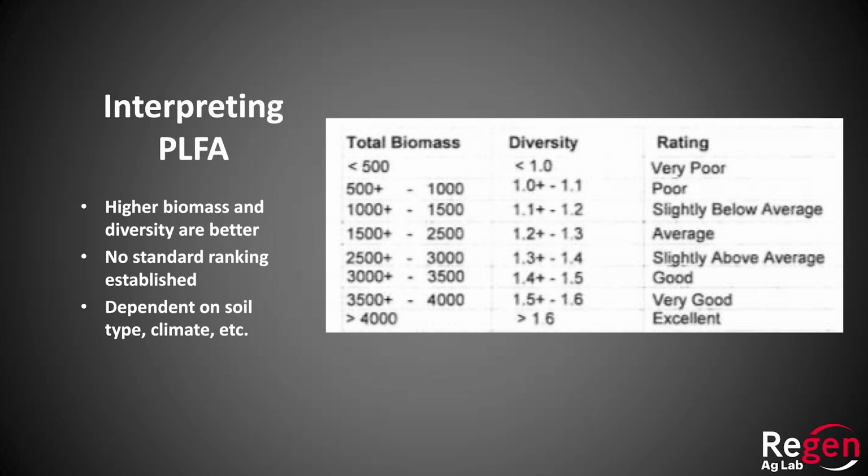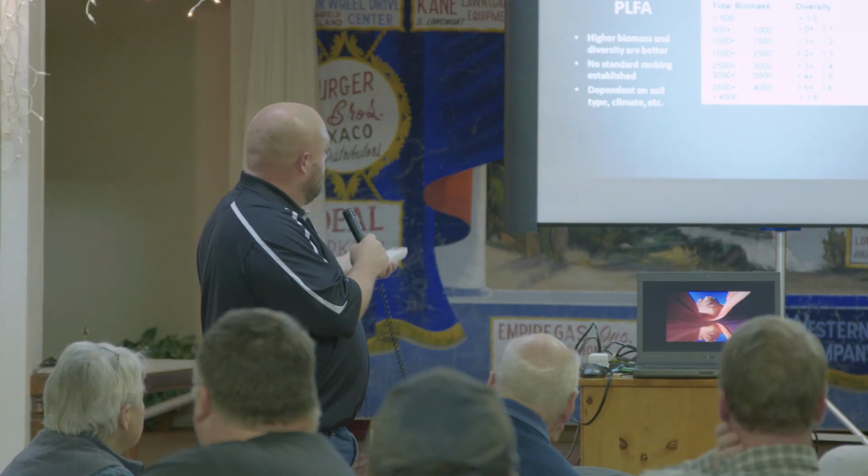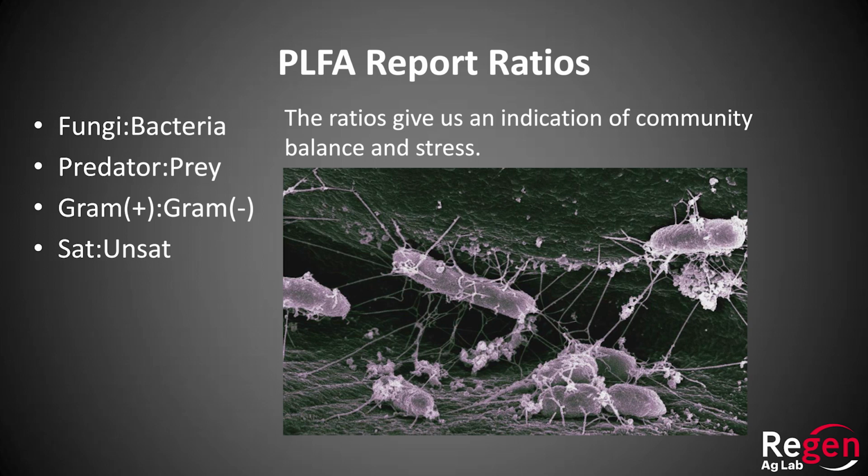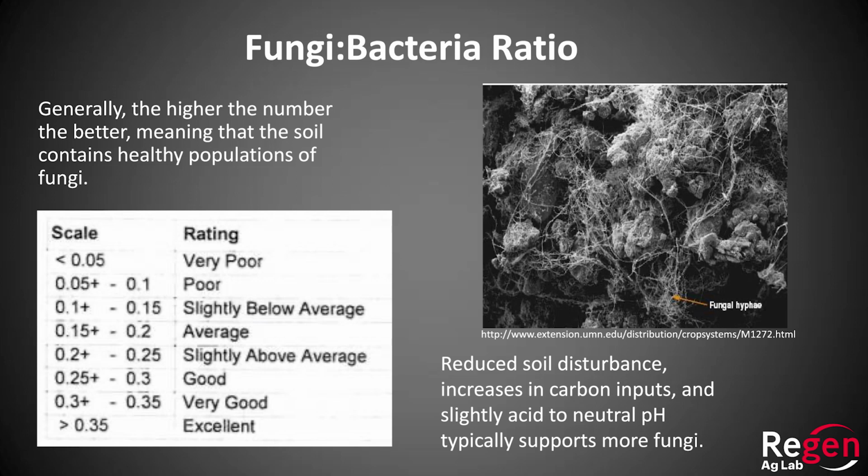A lot of you saw this table today and we went through it, so I'm not going to spend a lot of time on it. But the real meat of this is with these PLFA report ratios. And we went through 3 out of the 4 of these today for the people that we did individual consults for. But I'll go through each of them a little bit more now. So generally on PLFA, the higher the fungal number, the better.